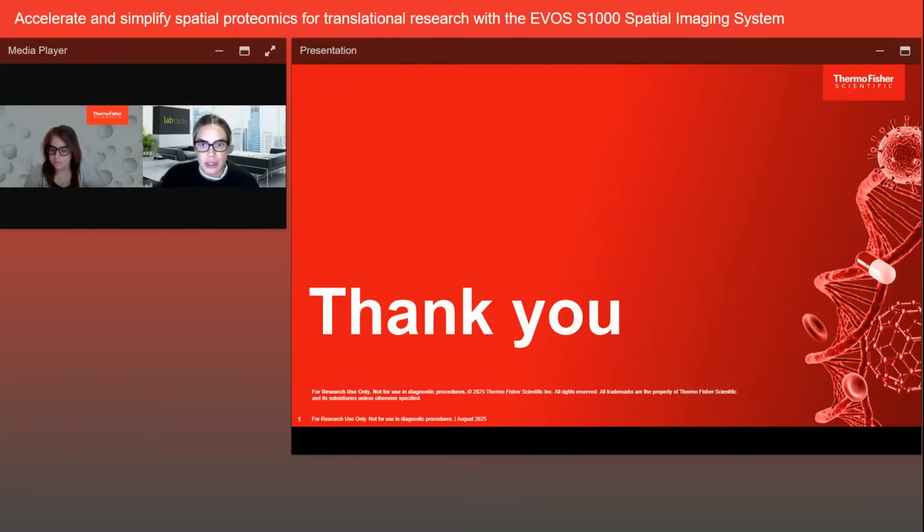The first question that we have says, can you elaborate on the compatibility of the EVOS S1000 with commonly available labeling methods and dyes in the market?